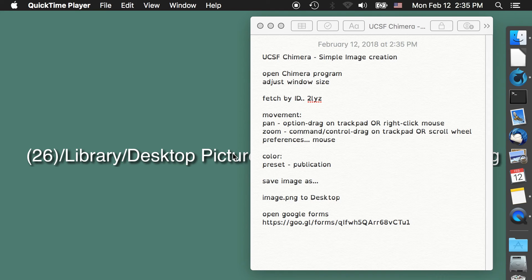Hello and welcome to the third video in my UCSF Chimera protein imaging series. Today I'm going to show you how to make a simple image in UCSF Chimera and then upload it to my Google Forms. This is primarily for my biochemistry class.